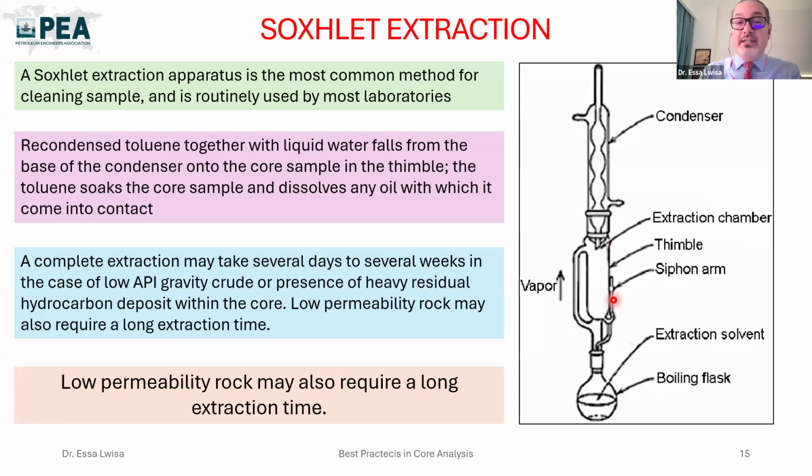What do we use to clean the samples from hydrocarbons? Usually we use toluene. And what do we use to clean the salt? Most likely we use methanol.